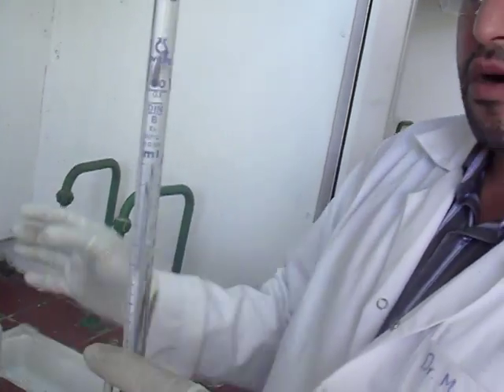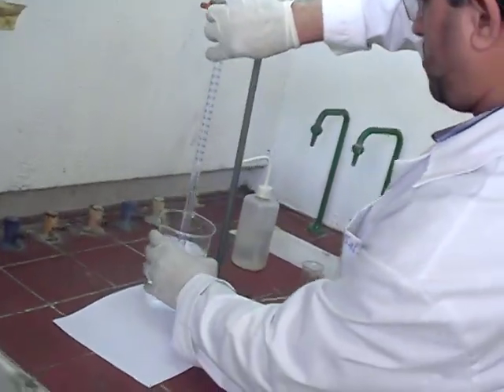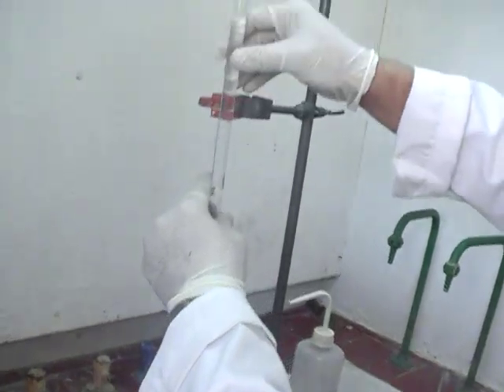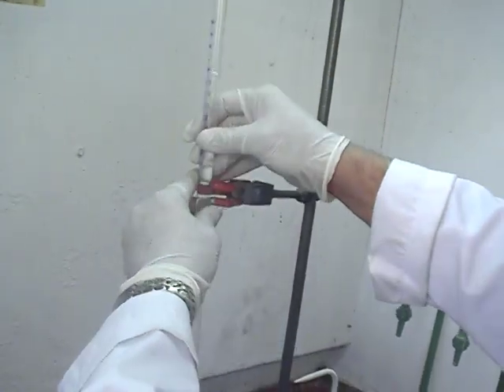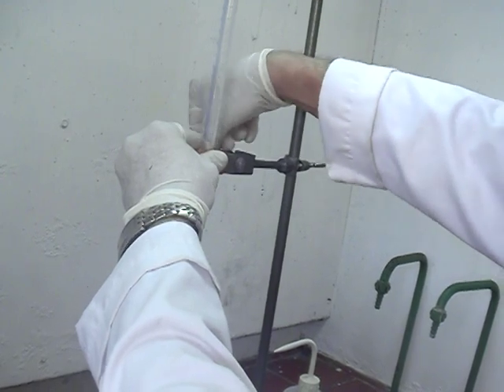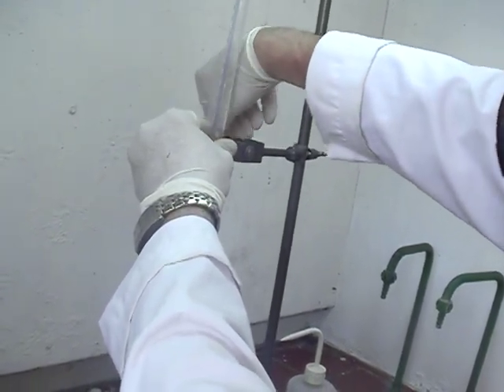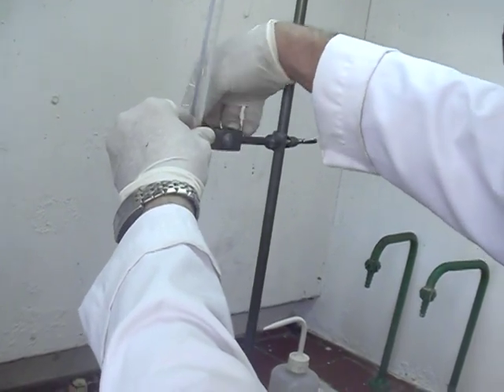Using your burette holder, adjust it at around two centimeters above the beaker level.